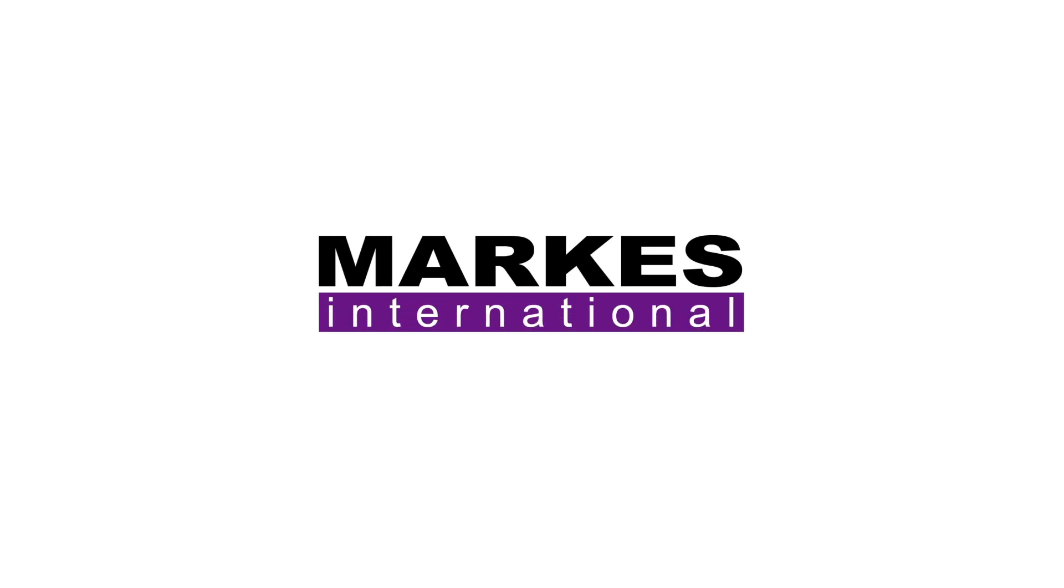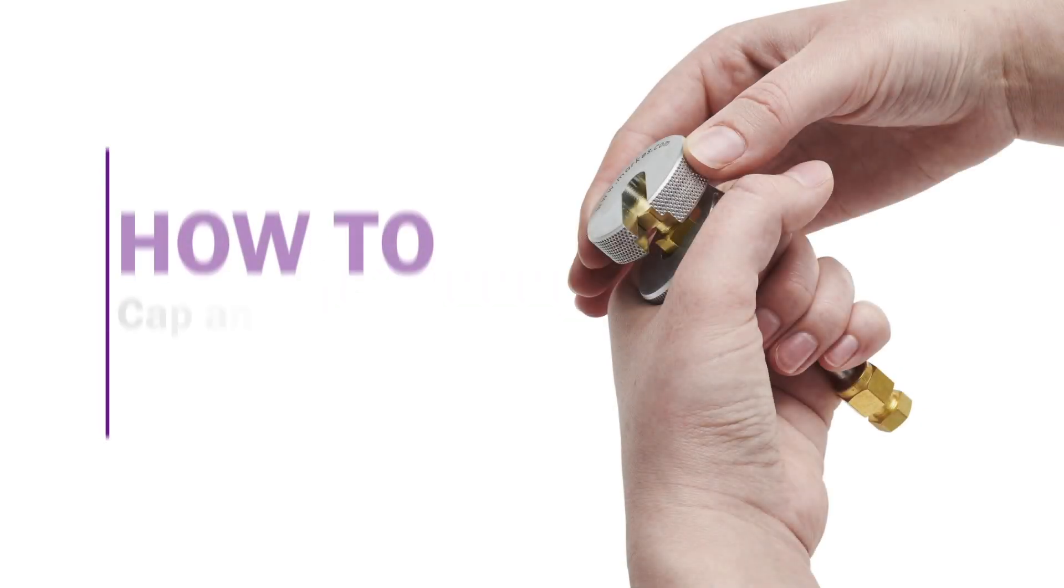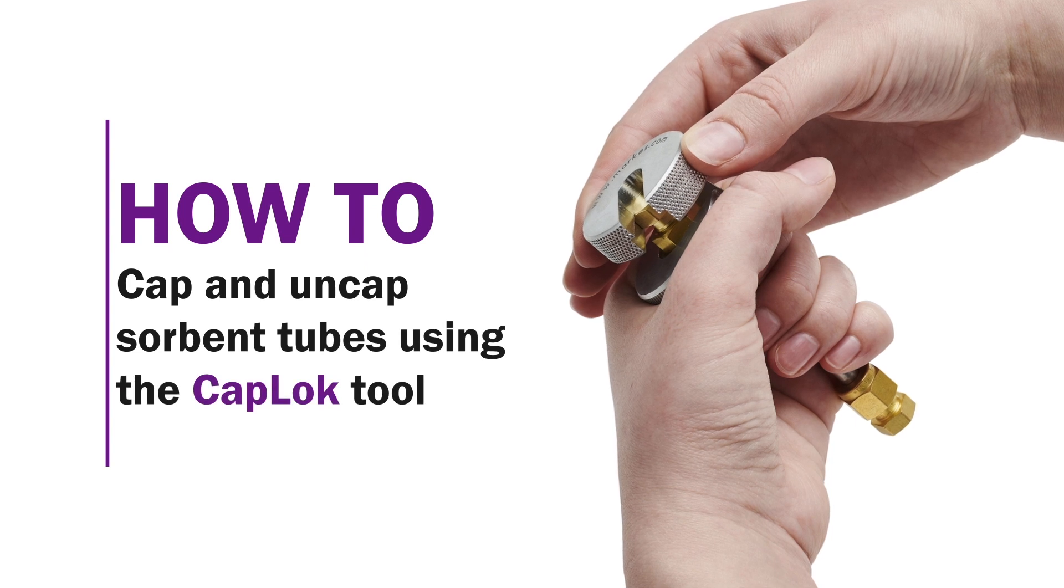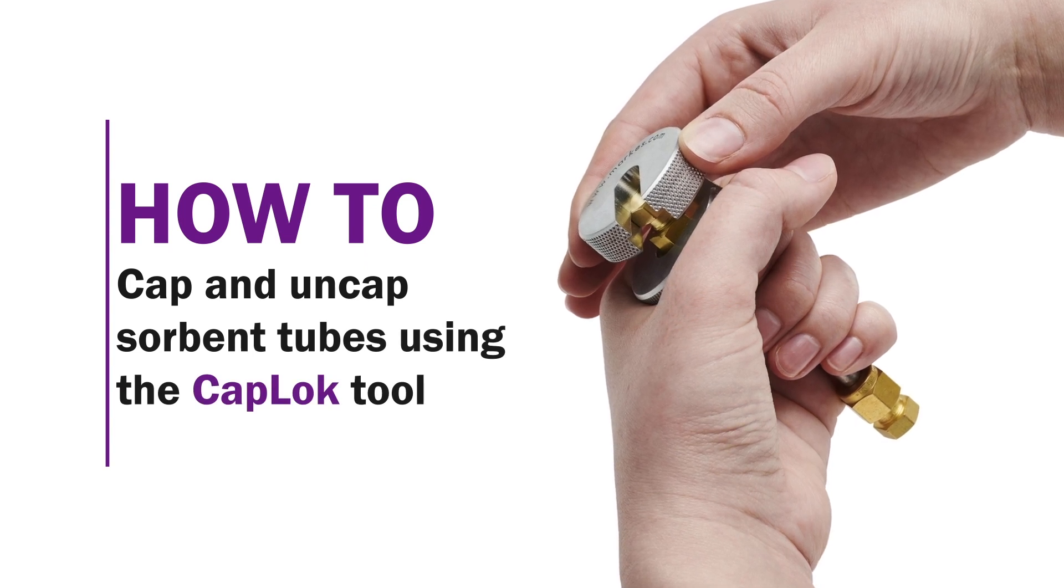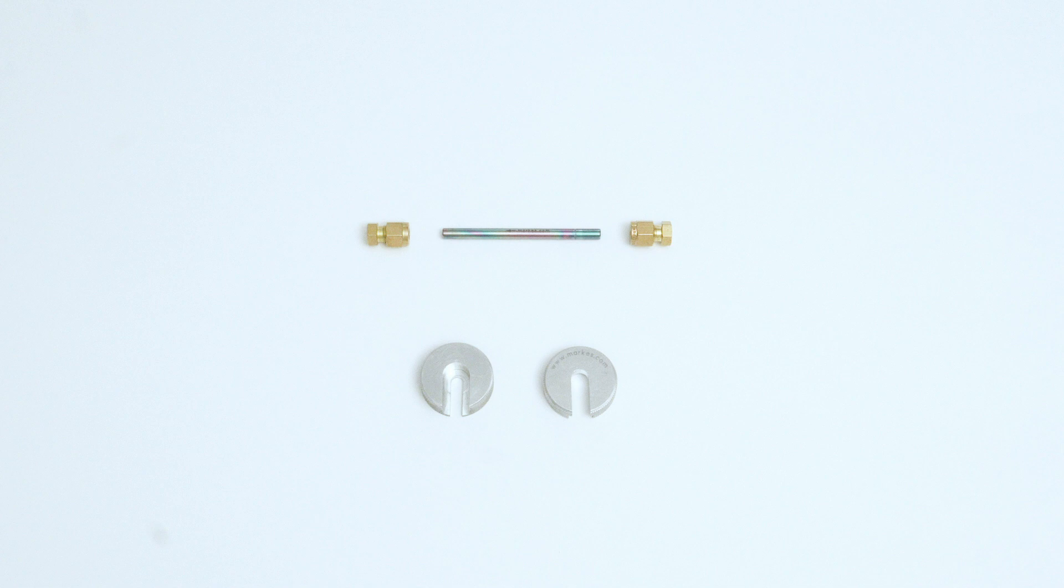The following video will show you how to cap and uncap sorbent tubes using a cap lock tool. Aside from during sampling and tube preparation, sorbent tubes should always be capped.